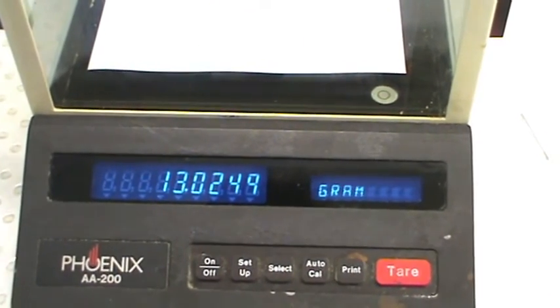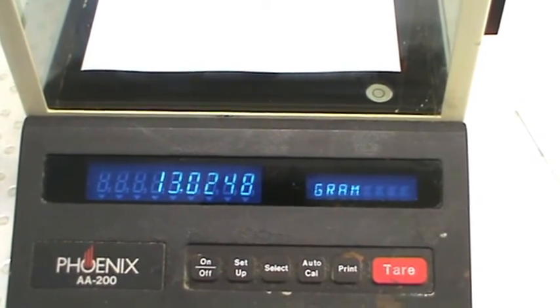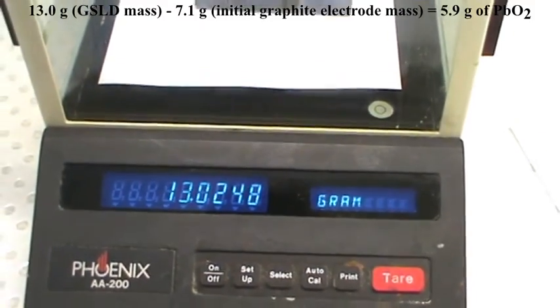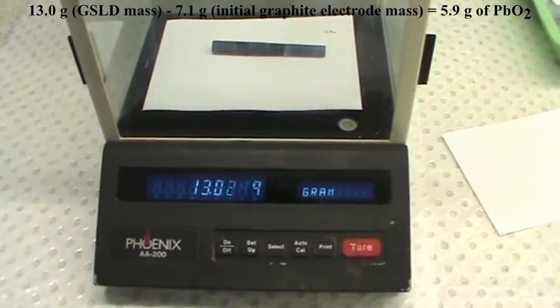To get the mass of lead dioxide, weigh the graphite substrate lead dioxide electrode on a balance, and subtract from the initial graphite electrode mass. We have 5.9 grams of lead dioxide, which is not bad for 2.8 hours.